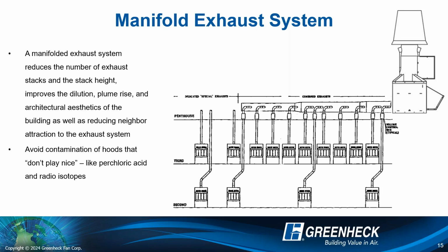Now, you got to be careful because some chemicals don't play nice with each other. So while we're combining a lot of the hoods that are doing common research, we still have hoods off to the left that might be doing perchloric acid or radioisotopes, things that you don't want to intermix with the rest of the general labs because it'll contaminate the system and cause problems. So in many cases, we'll see a lot of hoods tied to our fans, and then you have a couple individual fans off on the side doing their own thing. So we don't have problems with reactions inside of the ductwork.